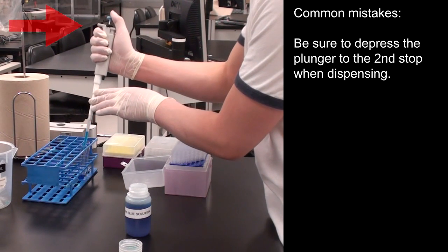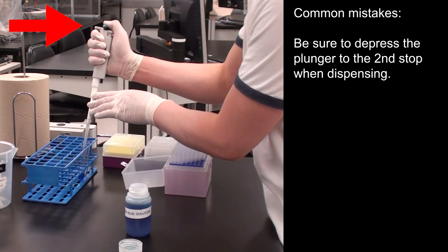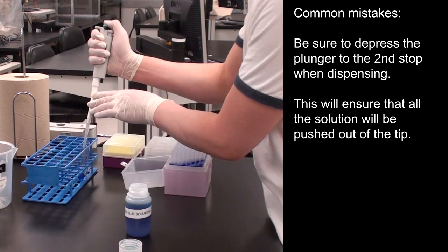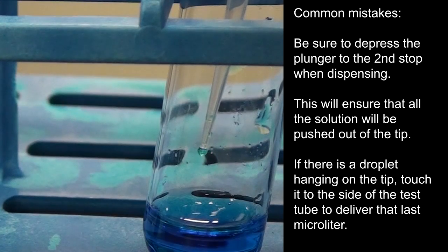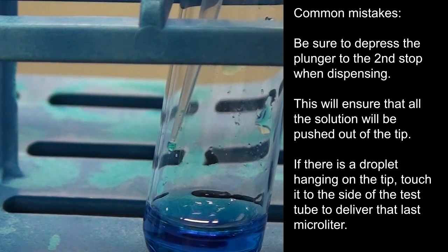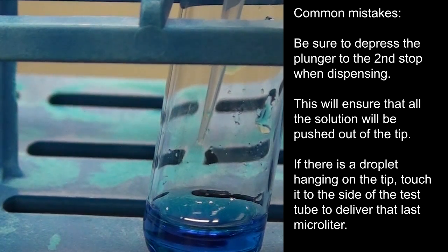Be sure to depress the plunger to the second stop when dispensing. This will ensure that all the solution will be pushed out of the tip. If there is a droplet hanging on the tip, touch it to the side of the test tube to deliver that last microliter.